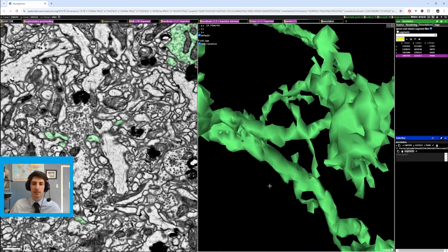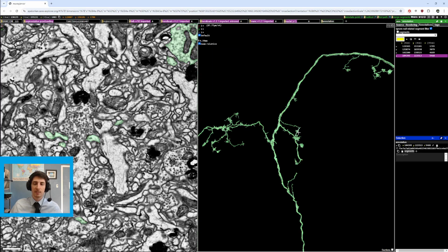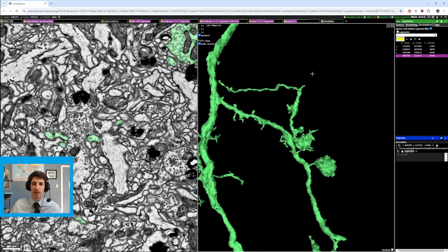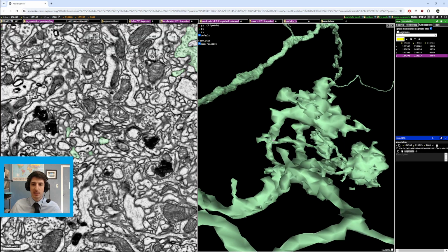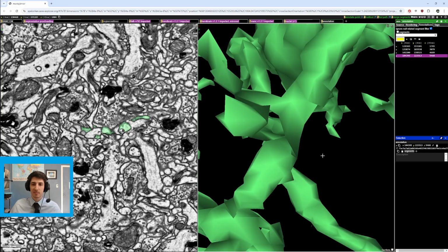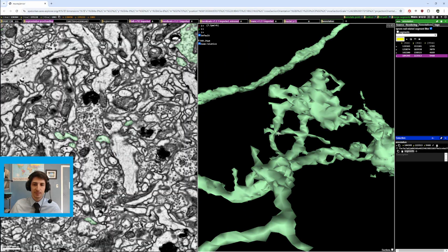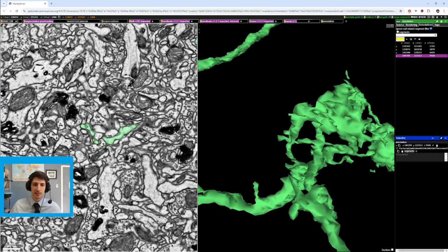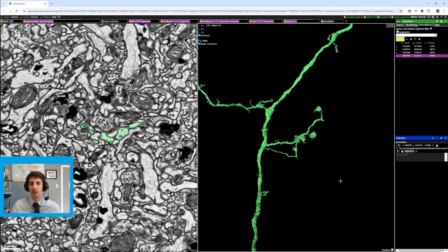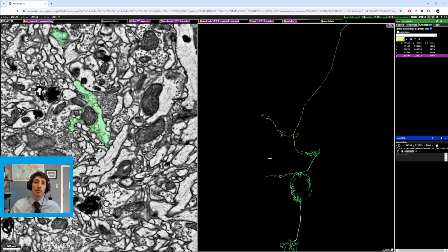This is a merger here too. This is probably large enough that you'd want to get rid of it. So probably get that out there too. One thing you could tell is, oh, it probably goes this way and it probably goes that way. But here's a little perpendicular branch that's very thin, connecting not really well to that. So probably just zoom in on that and take a look. Yeah, so you can see two unique different ERs here, and what connects them has no ER. So pretty good indication that that's a merger. So that's how you use two similar cells to help trace both the cells at the same time.